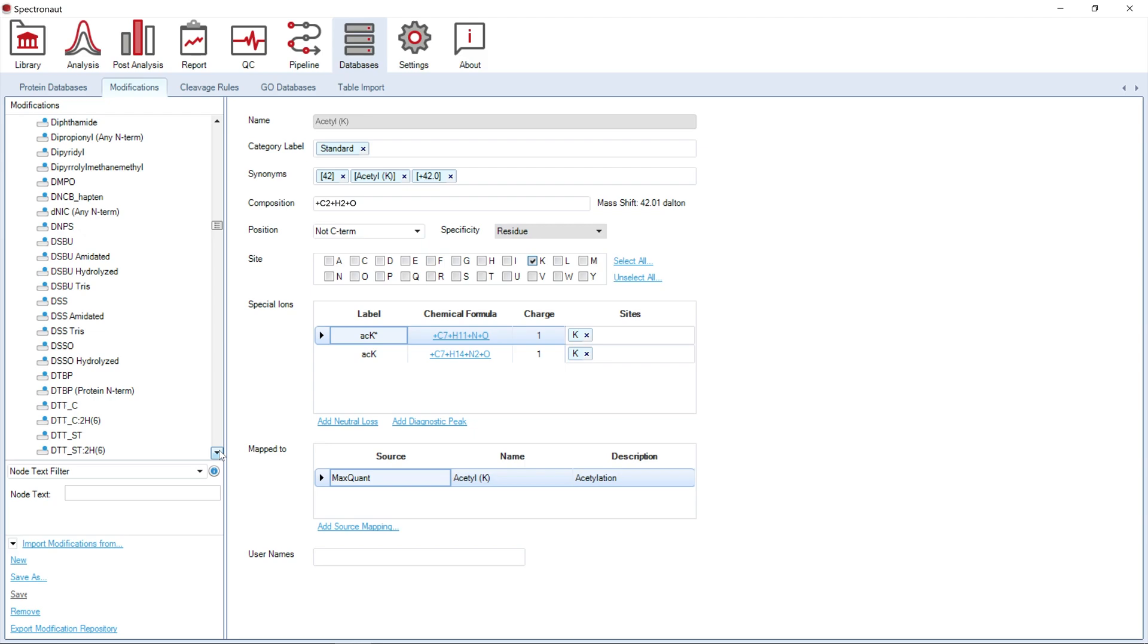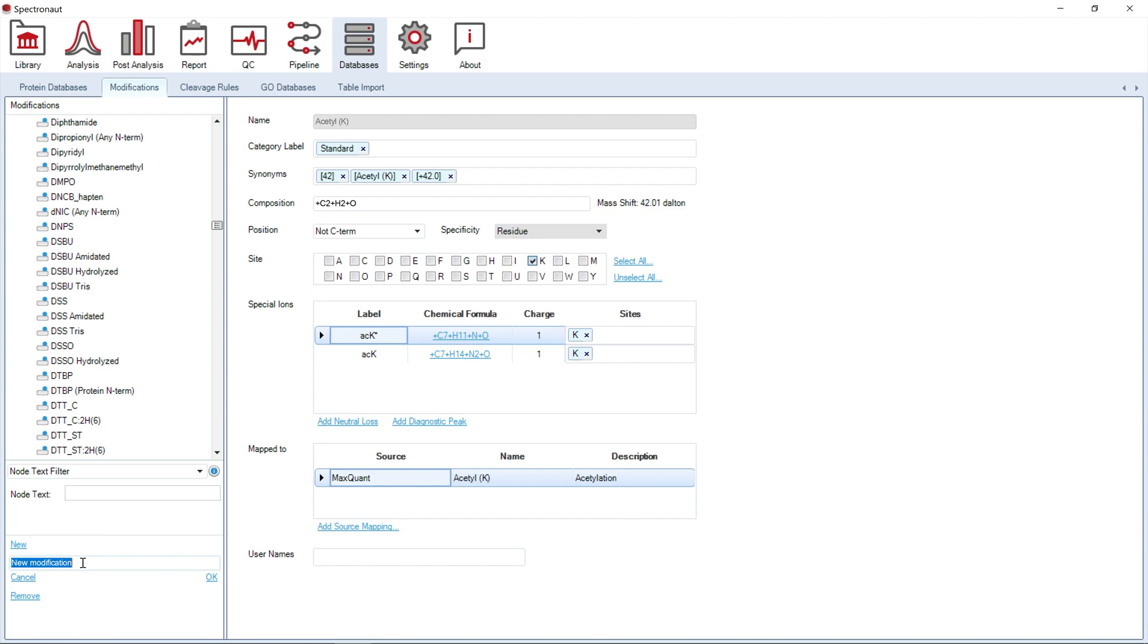If you use any special modifications, you can simply import the corresponding modifications file into Spectronaut, or you can specify a new custom modification.